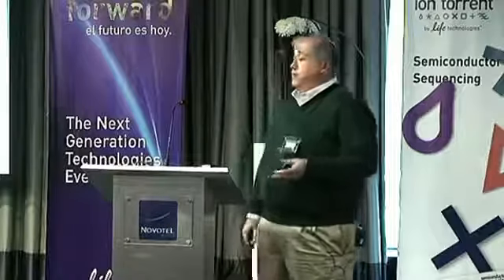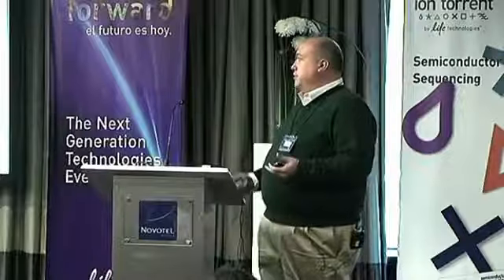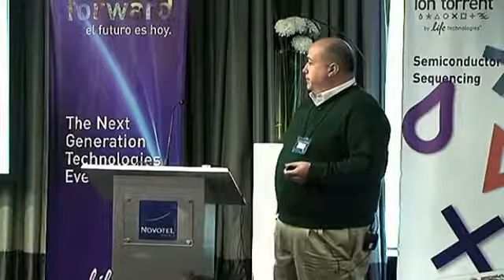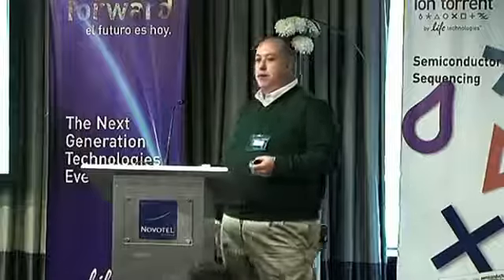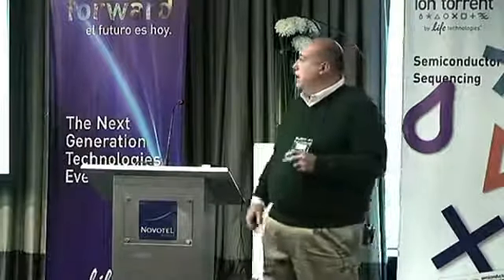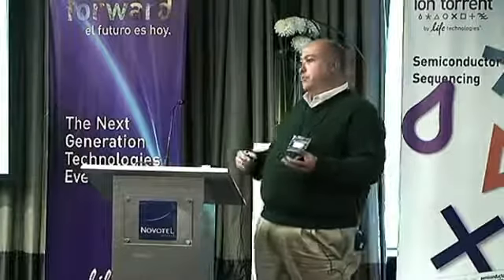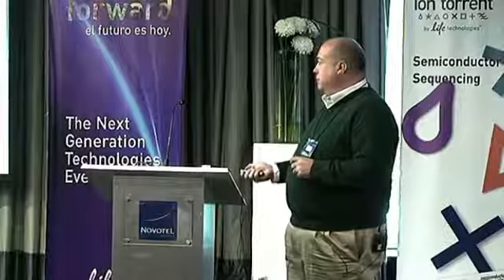I want to take you through the first impressions of the PGM from the early days through some of the presentations we made at a couple of the conferences in the US. Then go through what we have right now, which is the PGM as one of our main confirmatory pipeline instruments for our exome or familial exome pipeline, and I'll explain that further. Then the first expansion, which happened at Christmas of '11 when we decided to go from 1 to 6 PGMs.